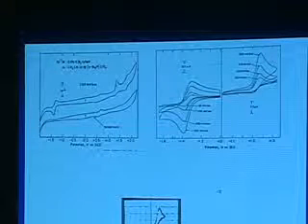Okay, so once you have the baseline, and so now we know which peaks are rhenium-based peaks, chlororhenium tricarbonyl-based peaks, then you can isolate this and just do a scan rate dependence over this region of potential, and you see something that turns out when you plot that out looks reversible. That is, it goes with the scan rate to the 1/2. You see there's very little shift in the peak-to-peak potential by eye there. That's a reversible system. On the other hand, when you do the oxidation, looking over there, as you change the scan rate, the peak goes up, but you might start to think that that is an irreversible system based on that. There's one peak. It doesn't seem to change with scan rate. It's not moving around too much.